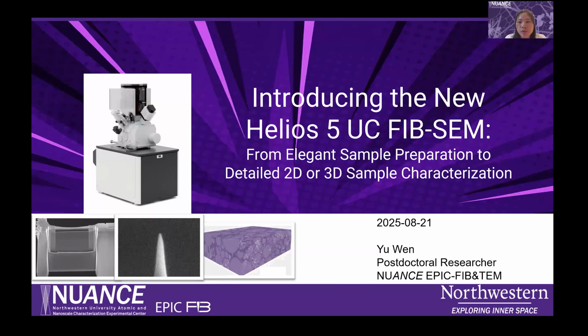So today I'm going to introduce our new instrumentation, the Helios 5 UC focused ion beam SEM system. It opens up many opportunities, from elegant sample preparation to two-dimensional or three-dimensional sample characterization.